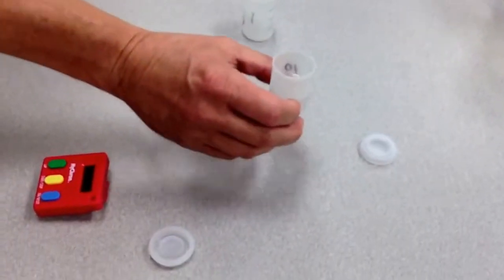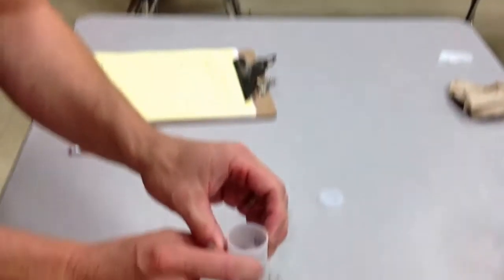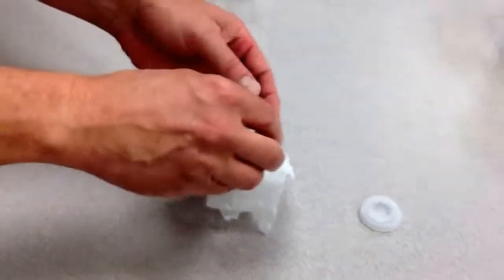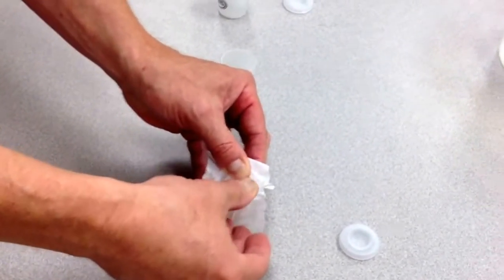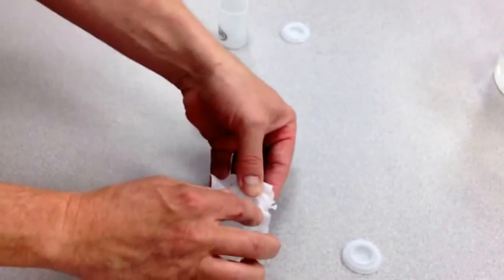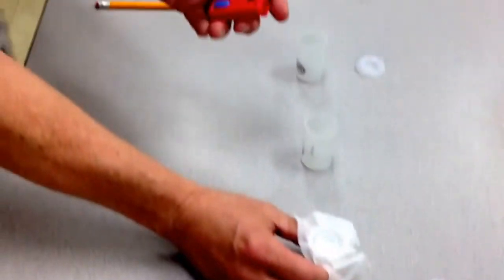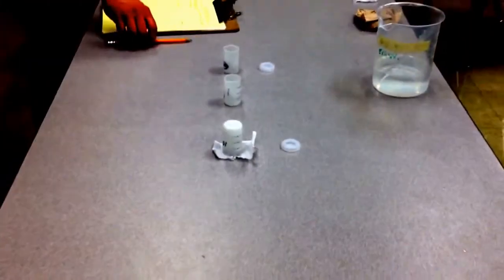What we have here is our 3 vials of water. We've already filled these up. I'm going to start with the half full container. What you'll do is you'll take your tissue, place it over the top, put the Alka Seltzer tablet on top. I'm going to move the timer out of the way here, and carefully seal that with the lid without tilting it or causing the water to slosh up there. Now I'm going to turn it over and start timing it right away. You ready? Here we go. And I'm going to step back and move my lab sheet.